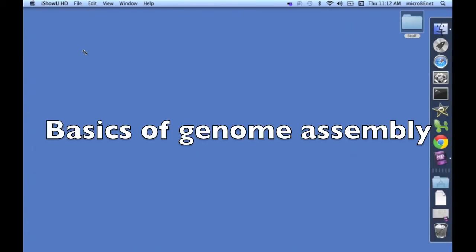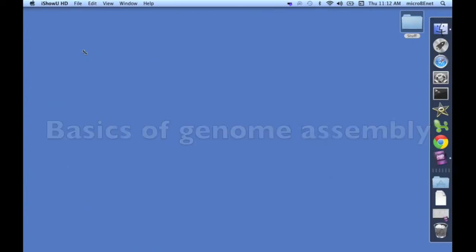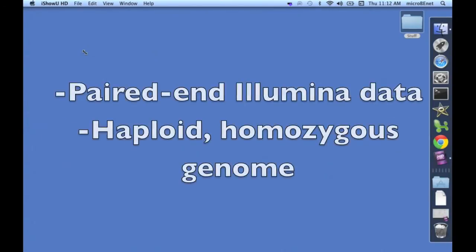Secondly, that you have a basic familiarity of the concepts of genome assembly. And thirdly, that you are attempting to assemble paired end Illumina data into a haploid homozygous genome.